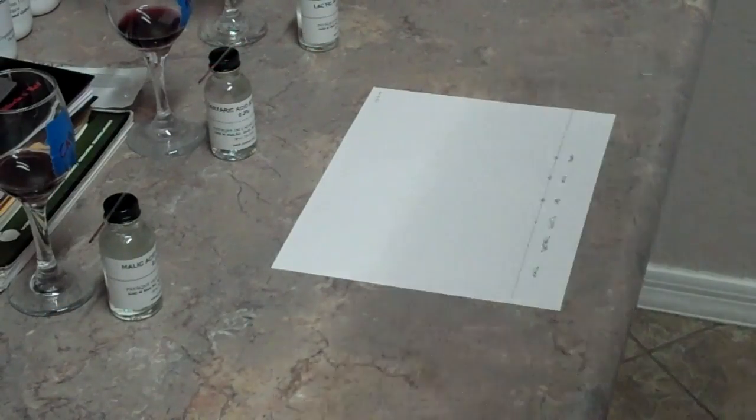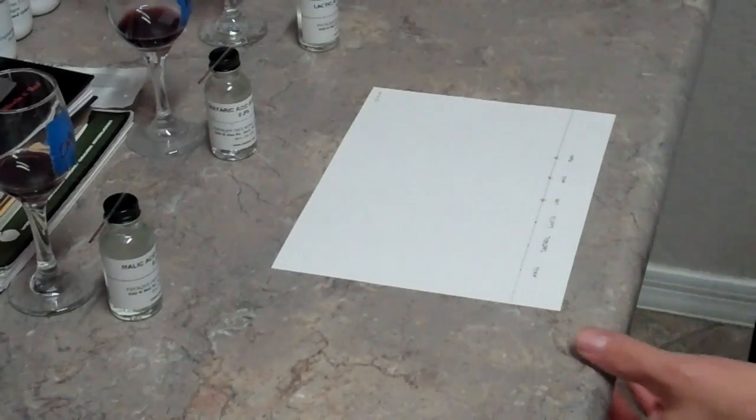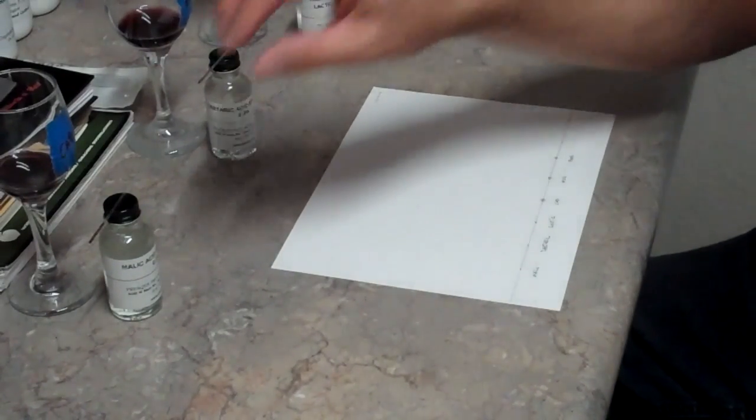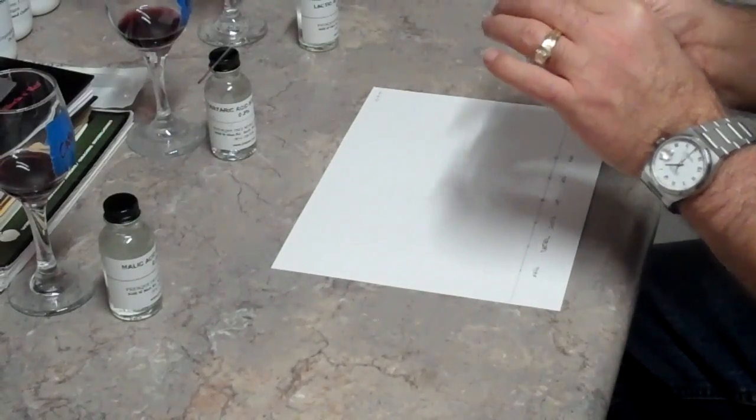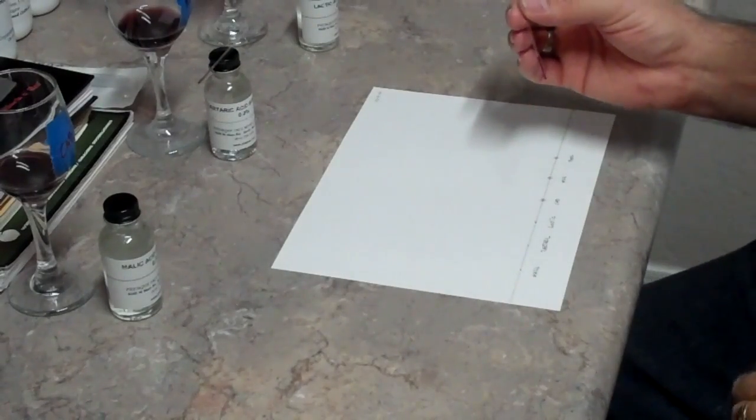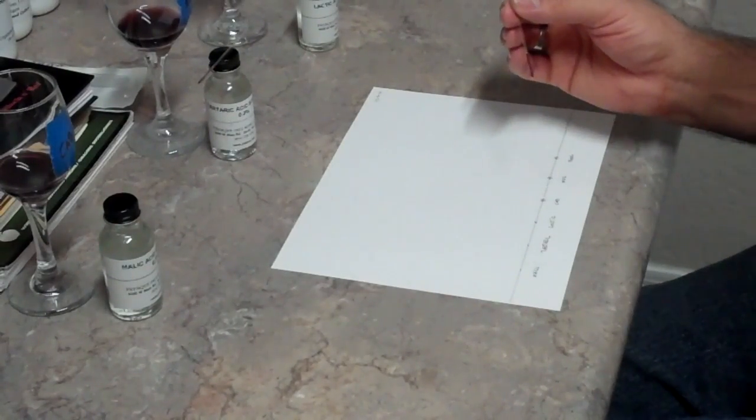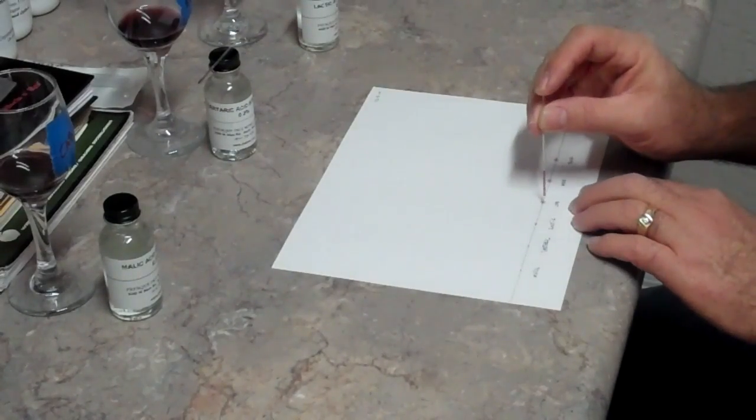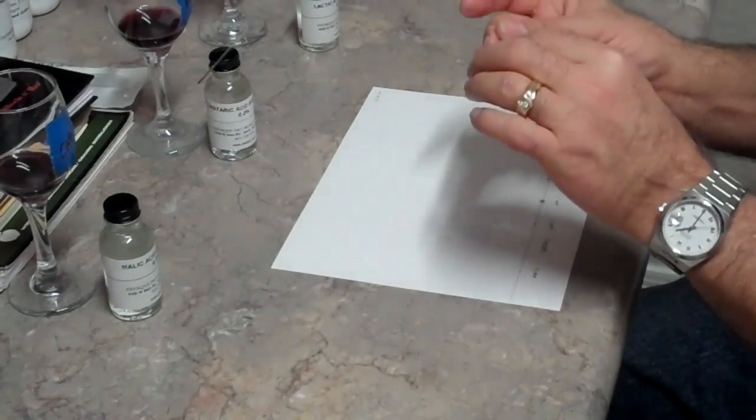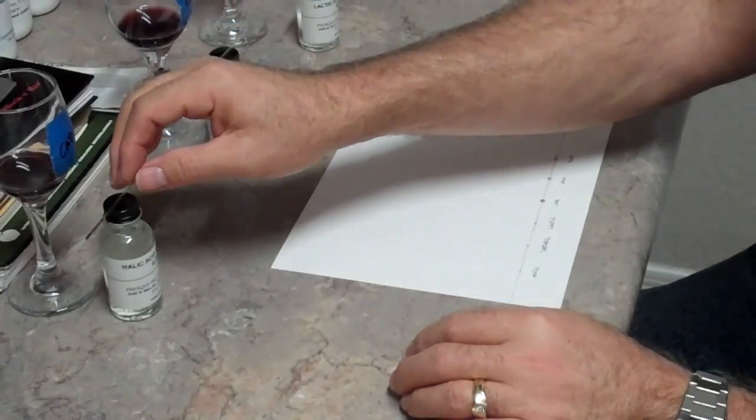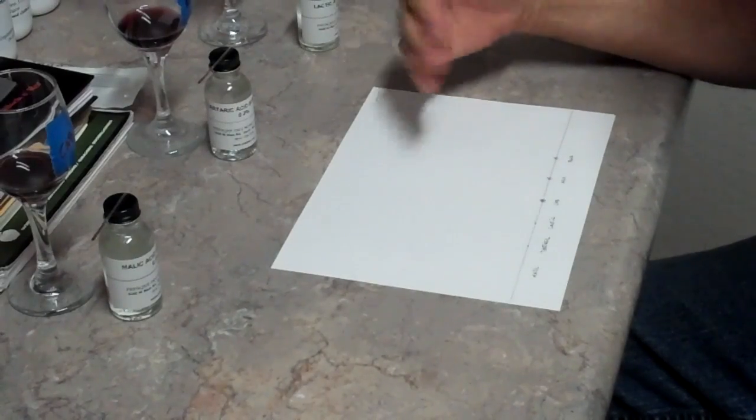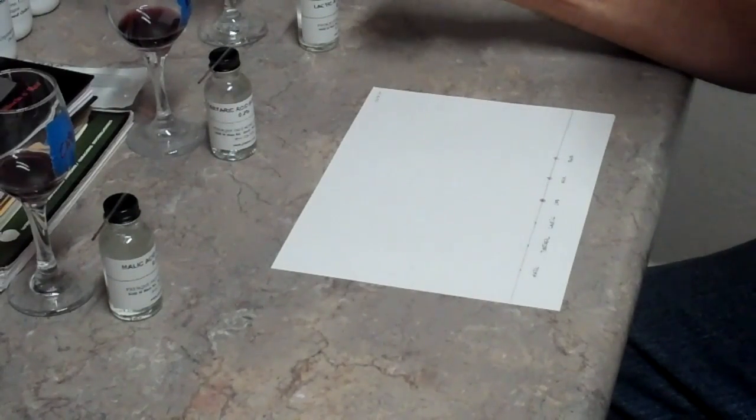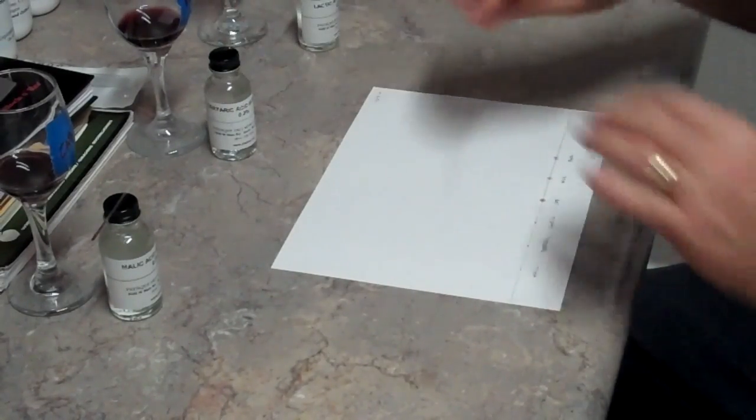Now we've drawn our samples from our wine, and we're going to start to apply those to the paper, just like we did our acid standards. This first dot here is the cab, and we're just going to do the same thing. We're going to dot it, and we're going to do that about four or five times also. We're going to let the whole thing dry for about 30 minutes after we've applied a dot of each wine.